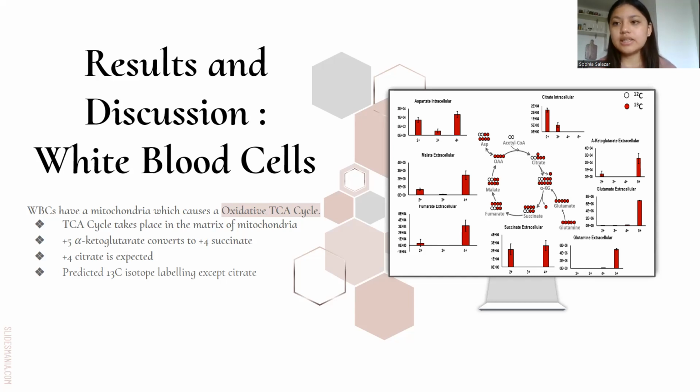I also want to note that TCA metabolism is cyclic, which means that the carbon-13 labeled metabolites in this second round are also evident in the data, and this is seen by the second highest bar in each of the plots.